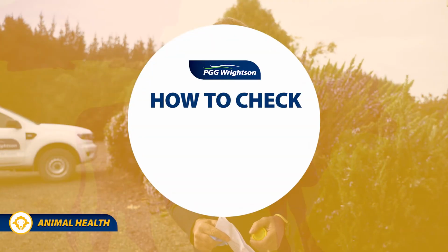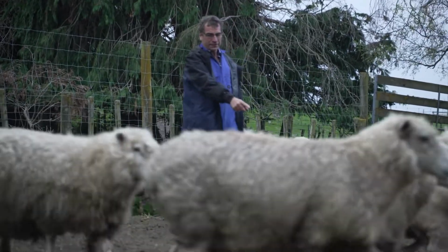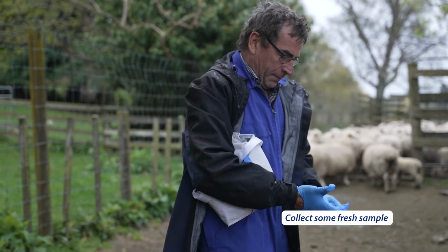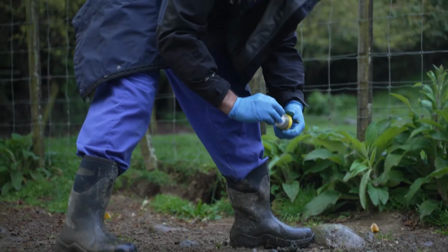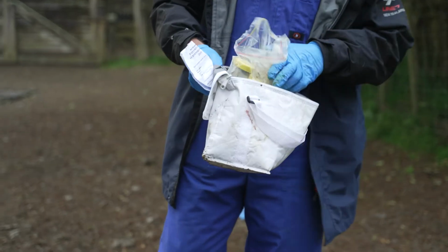Today I want to talk about two ways that we use faecal egg counting, investigating the worm burden in our sheep. So I've been out and I've collected some faecal samples. And what I was looking for were nice fresh samples, ones that didn't have too much grit or dirt in them, and they obviously were warm. I want them to be nice and fresh because in the old faecal samples the eggs may have hatched and I won't be able to see them.